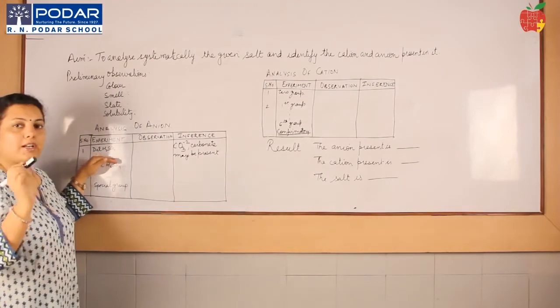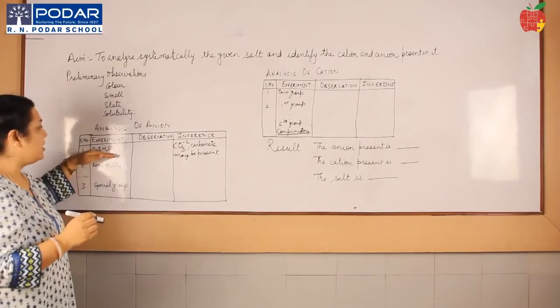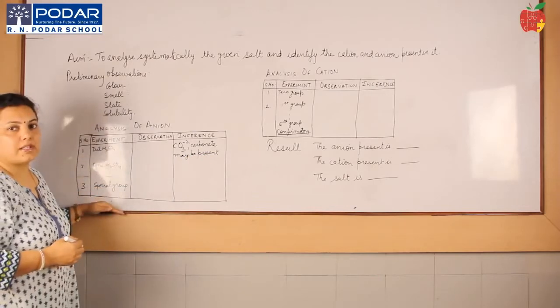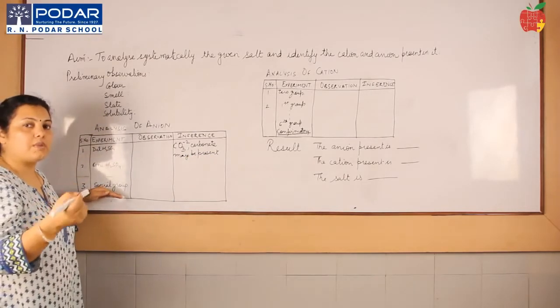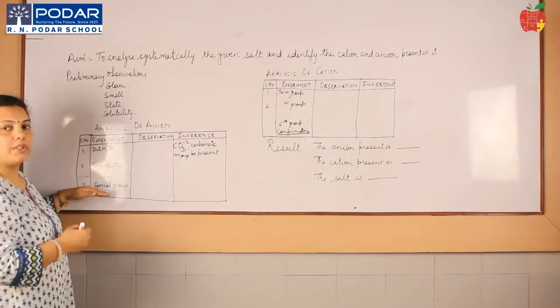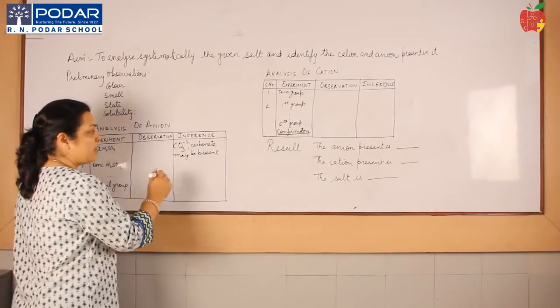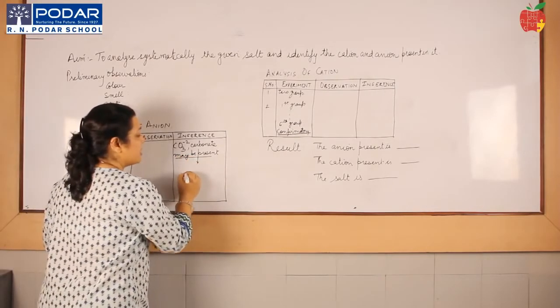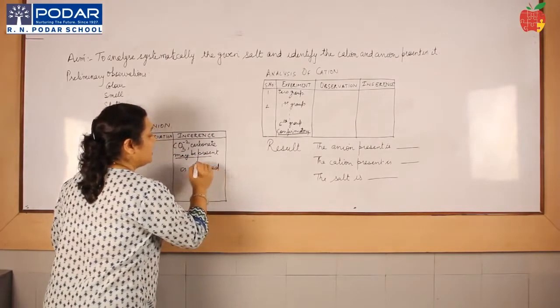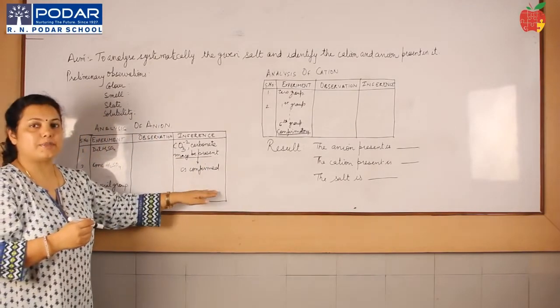Now once you have got carbonate, there is no need to write concentrated sulfuric acid and the special group. When you've written carbonate may be present, you can mention the confirmatories after that. The confirmatories you already know, magnesium sulfate test. So after that you will write down the confirmatory test, you will write down both the tests for carbonate, the observation, and in the same way, when you're doing the confirmatory, your may be present will change to is confirmed. So when you're doing the confirmatory test, instead of carbonate may be present, you will say carbonate is confirmed.